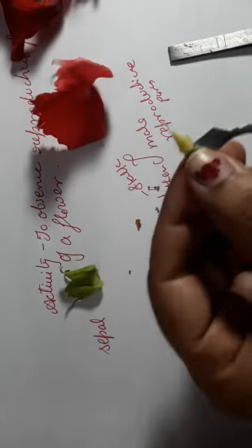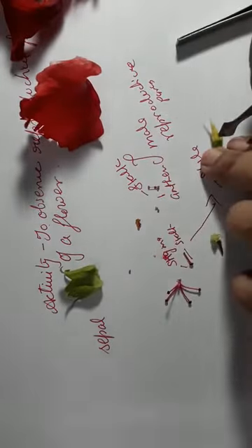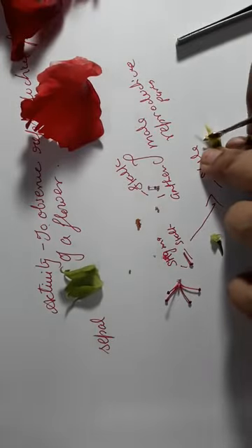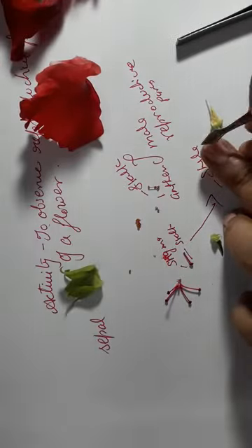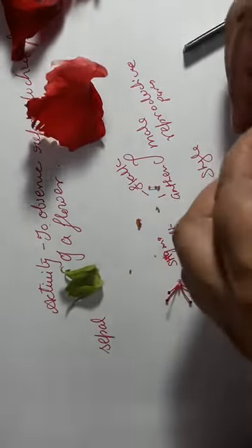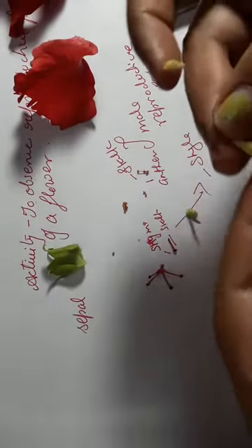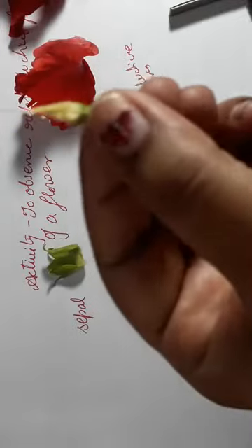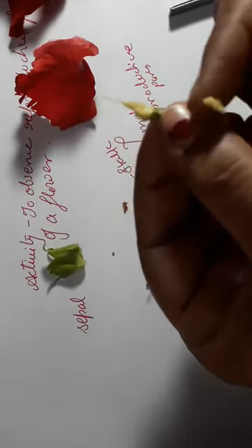Now you can see over here, I'm going to cut this from here, and then you will see. If you zoom in, can you see this round structure?